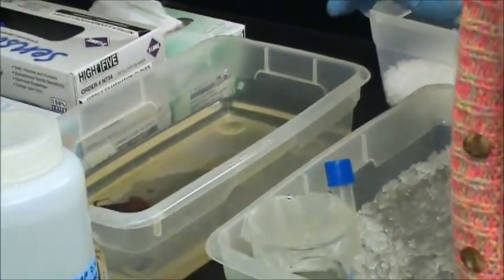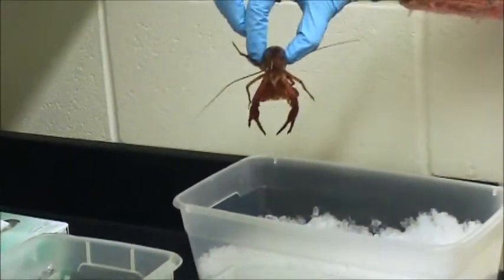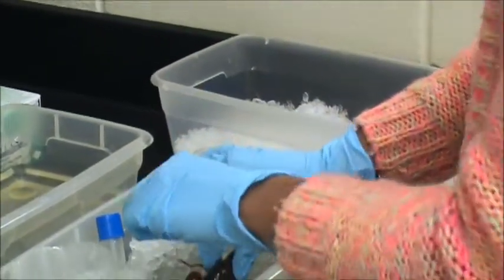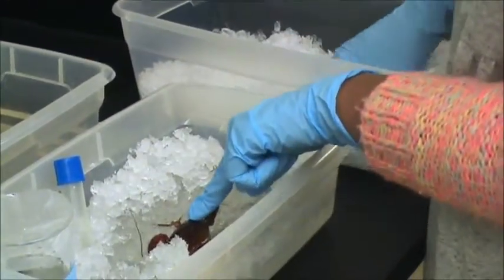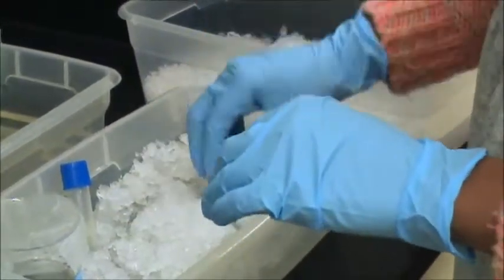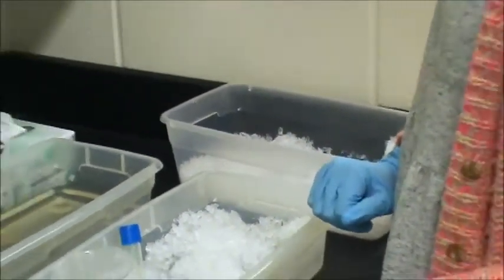So we're going to want to pick him up, and you're going to want to be careful when you do this. So you look here. We're going to want to place him in this ice right here. We're going to hold him down so he doesn't squirm. We're going to just put a good amount of ice on him, and we're going to leave him in here for about 10 minutes, and that will do the trick.